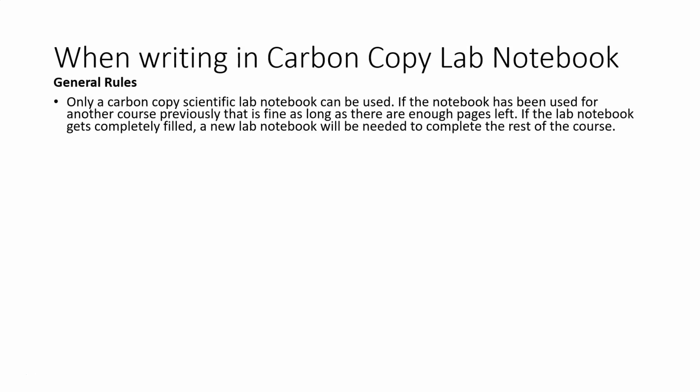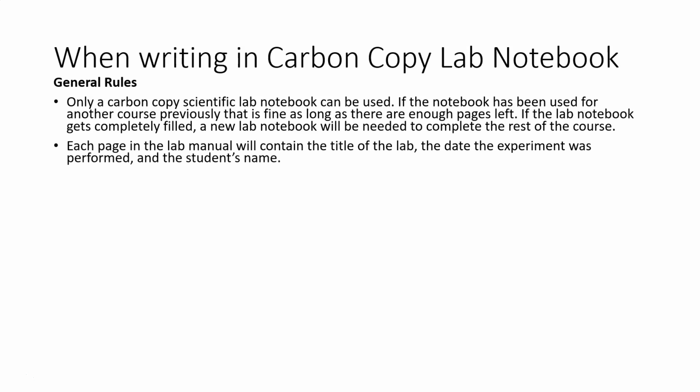If you do not own a carbon copy lab notebook, you're going to have to get one before our first lab. On every page in the notebook, you need to have the title of the lab, the date you performed the experiment, and your name. Let's say one lab took 4 pages of your carbon copy lab notebook before you got all the information in there. Each of the 4 pages has to have all this information on it.